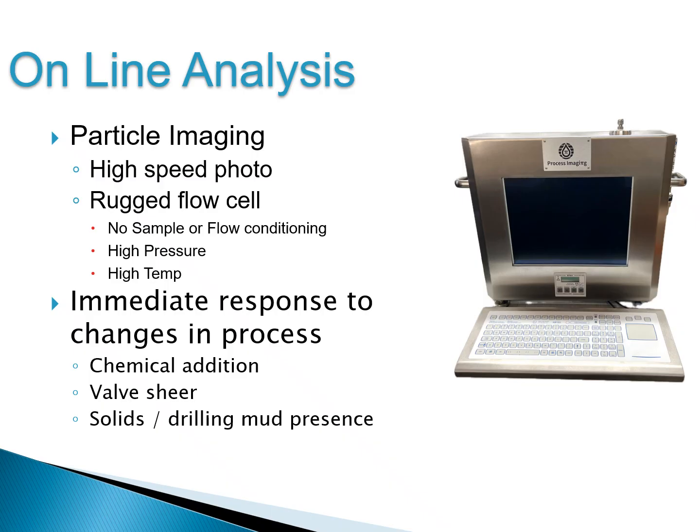The water can be passing through that rapidly, and every particle in each image will be sized and typed. So these devices will be able to look at a water sample and say the oil concentration is 10 parts per million, 30% of all the oil droplets are below 5 microns, 50% of all the oil droplets are below 10 microns, and 75% are below 30 microns.